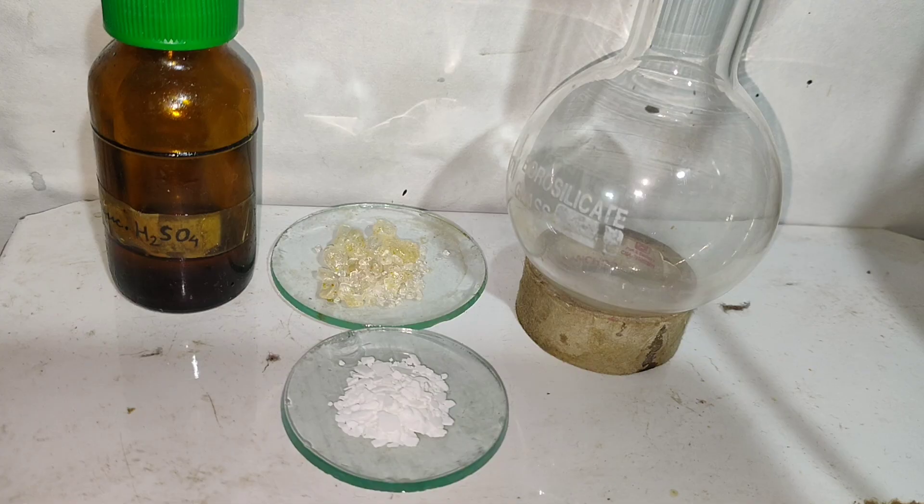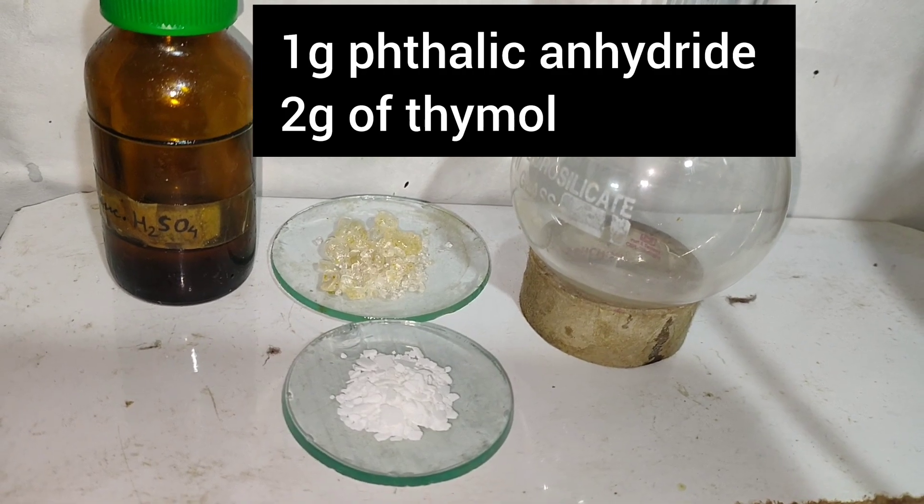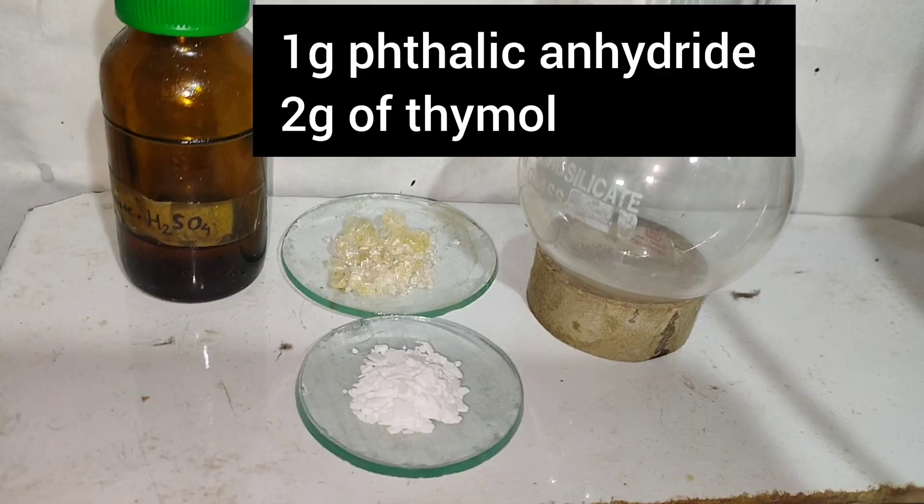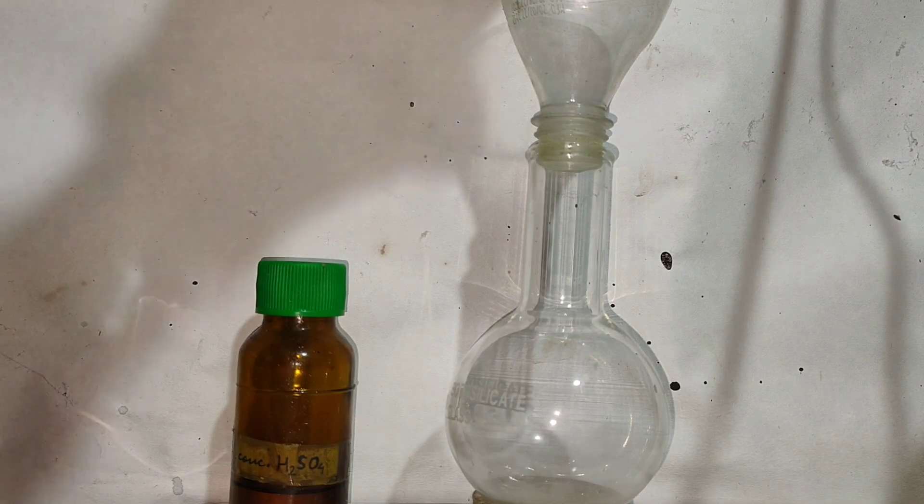For the synthesis, we require 1 gram of phthalic anhydride, 2 grams of thymol, and 4 to 5 drops of concentrated sulfuric acid.